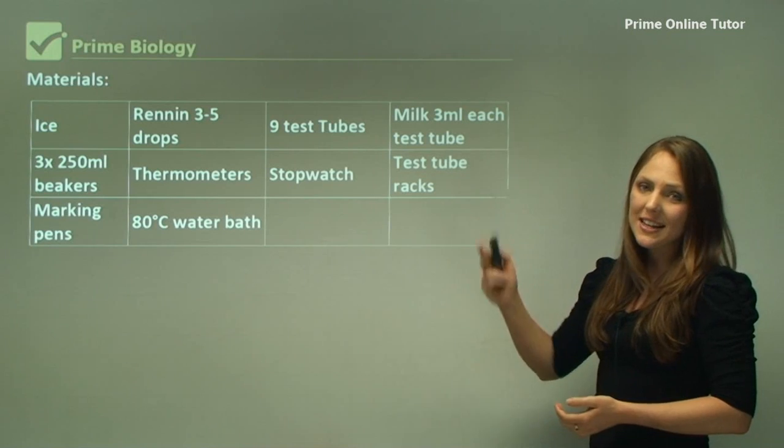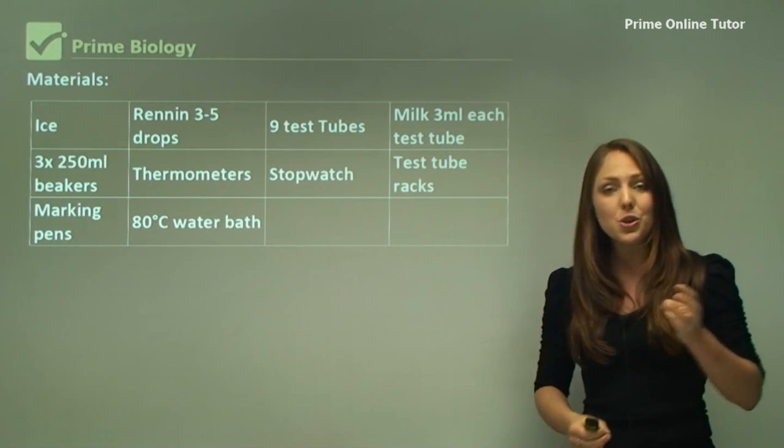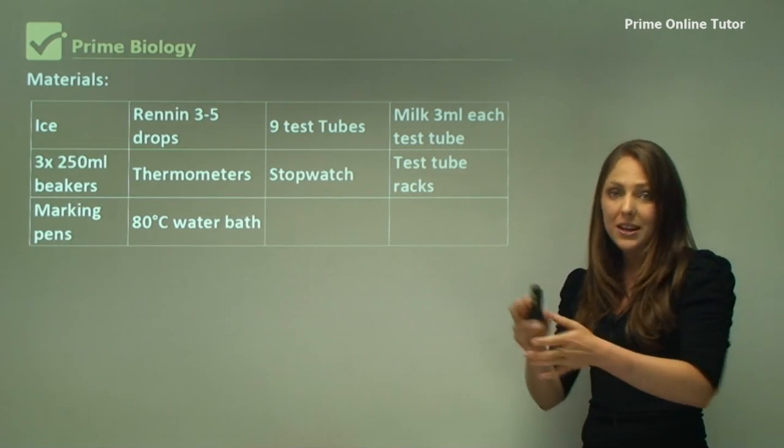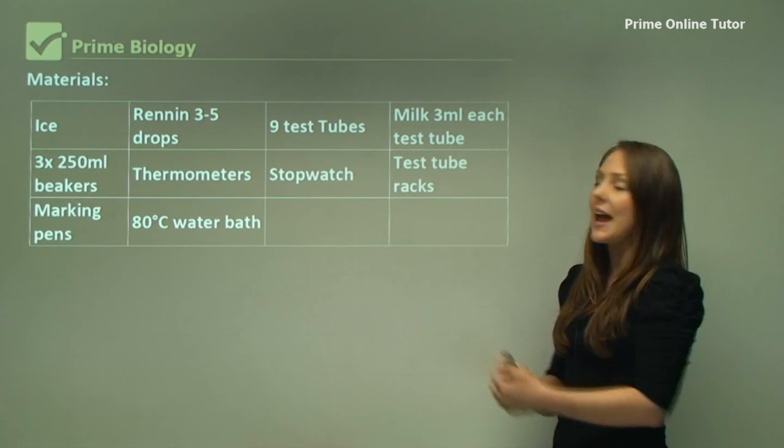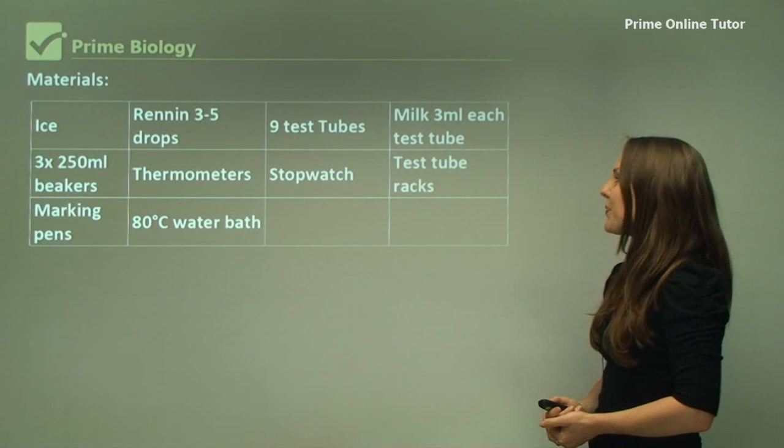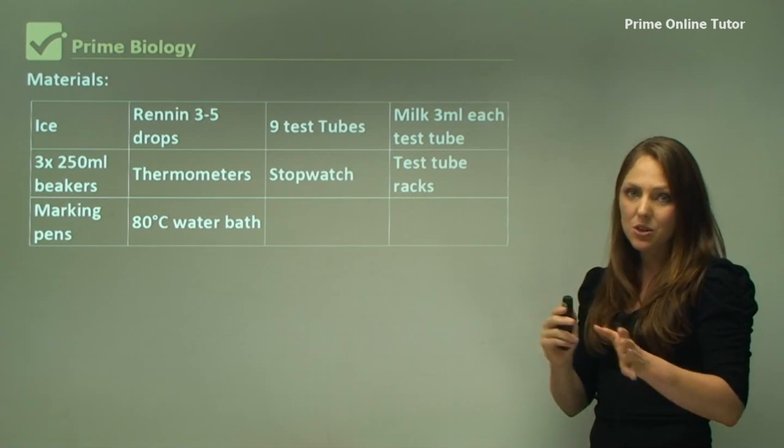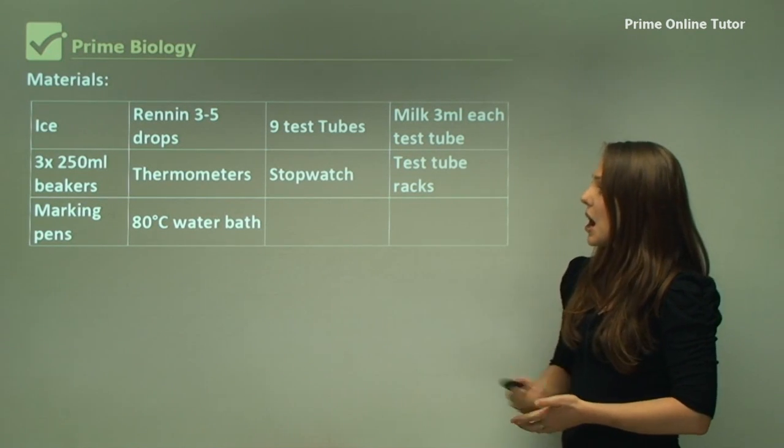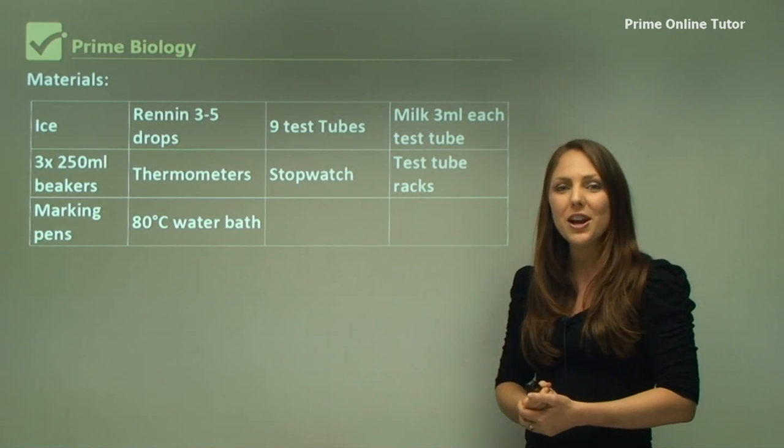We have nine test tubes: three test tubes in each environment, so three in an icy environment, three at about 40 degrees, and three at 80 degrees. We have three mils of milk in each test tube. We need test tube racks to hold the test tubes.